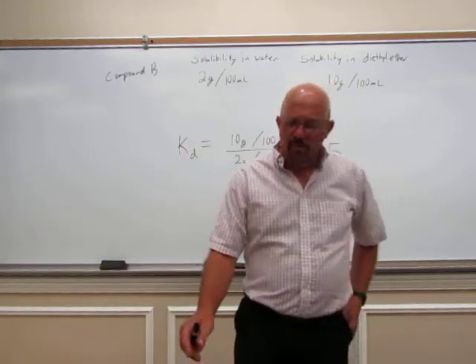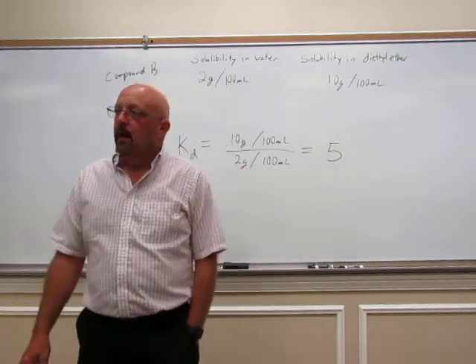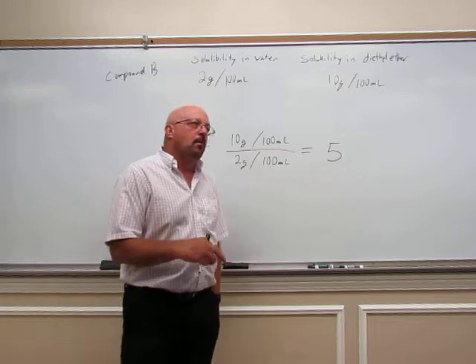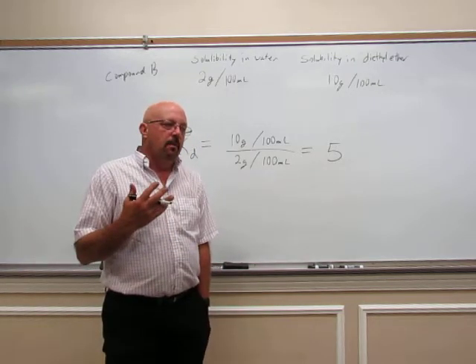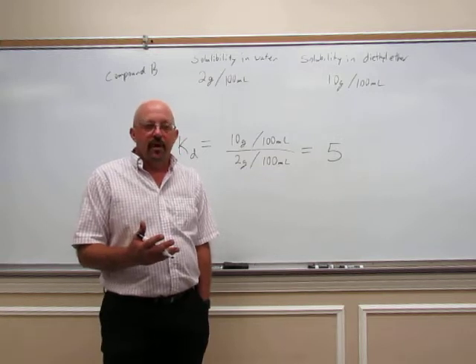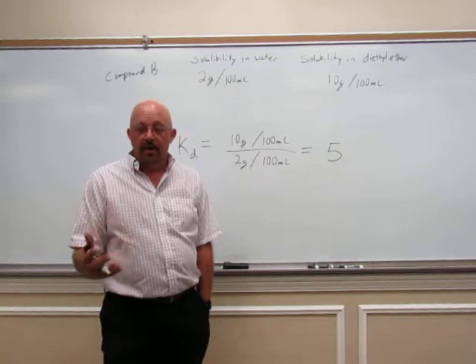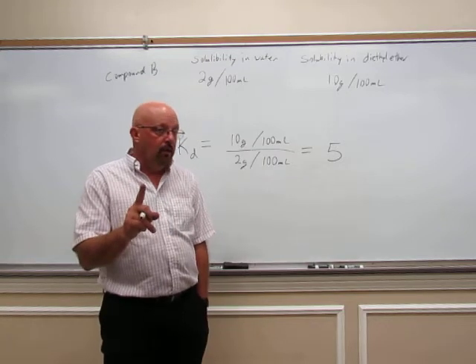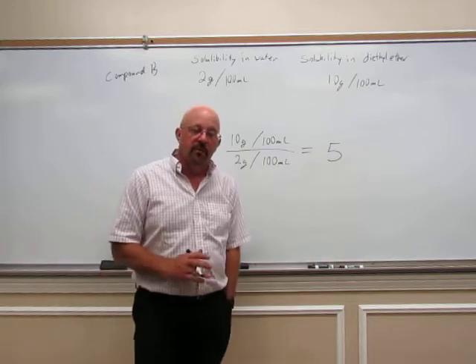Now, when we do extractions, we're only going to do one extraction this week. But in the future, when we do liquid-liquid extractions, it is better to do several small extractions than it is to do one big extraction. Again, we're only going to do one this week because all we're trying to do is determine the distribution coefficient.